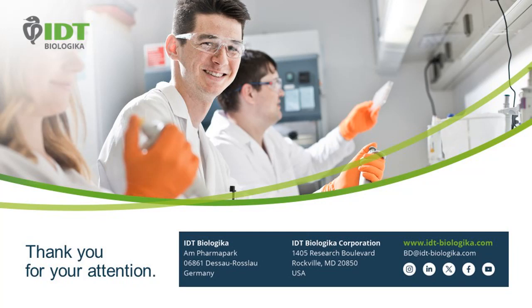Next question. What are the AAV and LV recoveries after each downstream purification step? So this is a question that I cannot answer here during this webinar. This is a little bit complex and also depends on the specific serotype and transgene at the end. But you are welcome to discuss this after the webinar in more detail by contacting me directly.